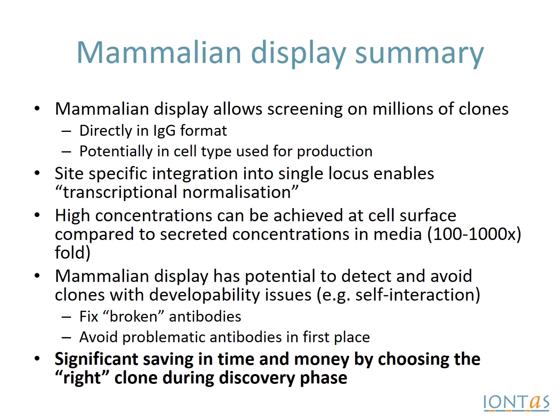The approach we've taken uses nuclease-directed integration to put a single antibody gene into a single locus within the genome, and in so doing we've basically achieved transcriptional normalization, and therefore any differences that we see in terms of expression are down to the properties of the antibody itself. But apart from just thinking about expression, we believe that the system is actually letting us see a little bit more into the biophysical properties of the antibody.